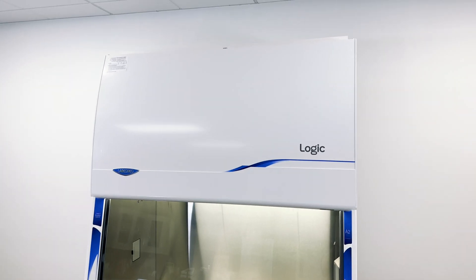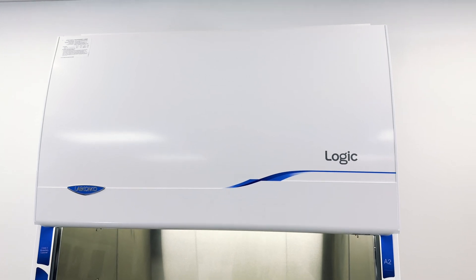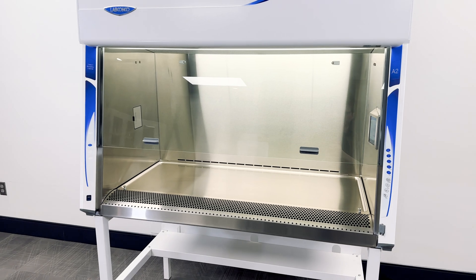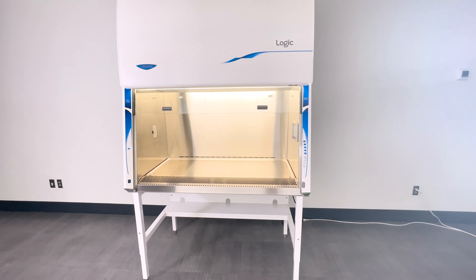The Logic is a Class 2 biosafety cabinet designed for a variety of applications requiring personnel, product, and environmental protection from biohazards and other hazardous particulates. In this video, we'll show you how to unpack and assemble it.